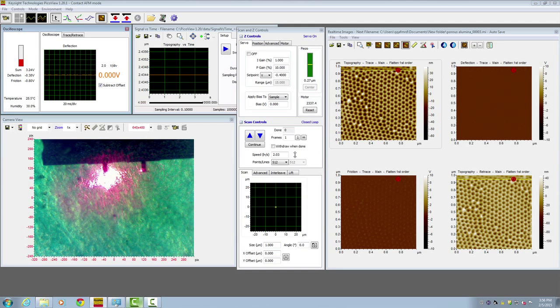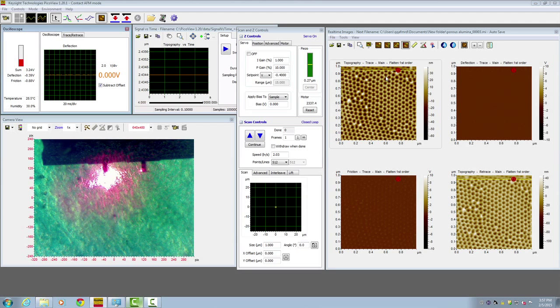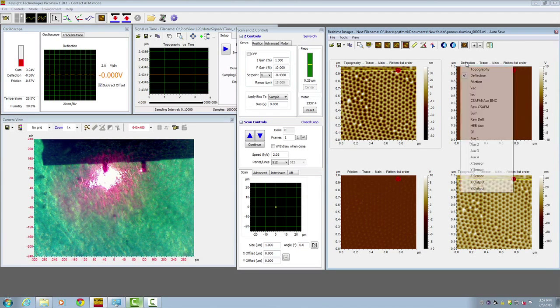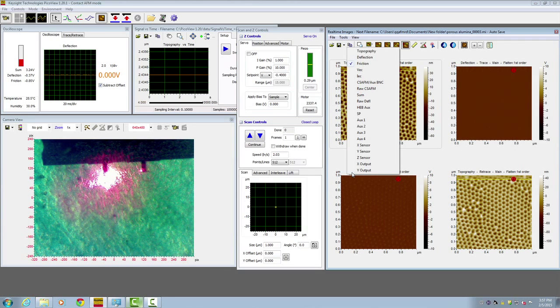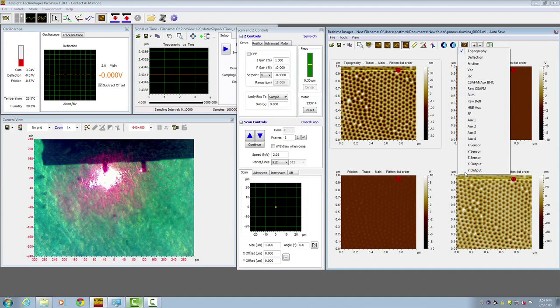Next, go to your imaging window and set it up so that you have topography, deflection, friction, and if you have an extra channel, you can set up whatever you want. Here I put topography and retrace window.